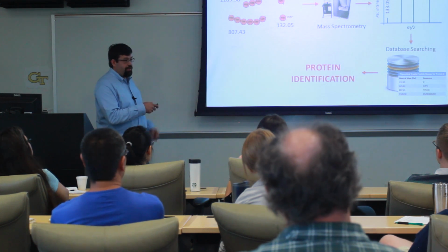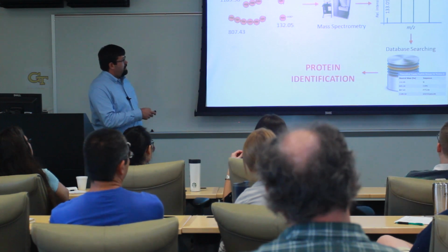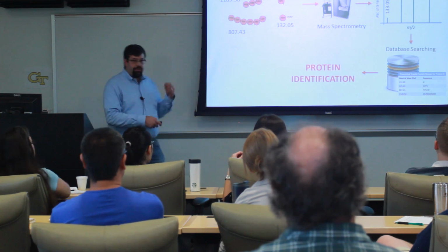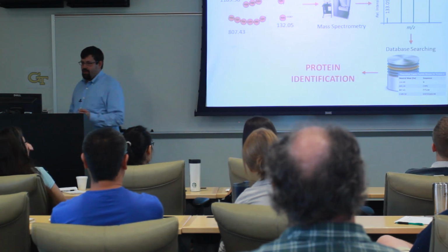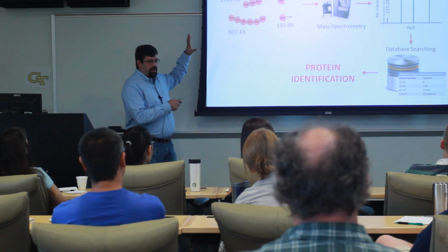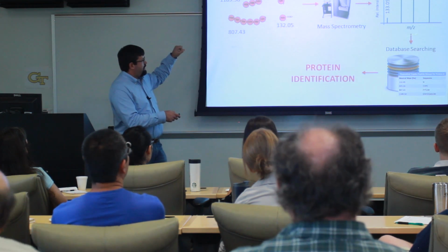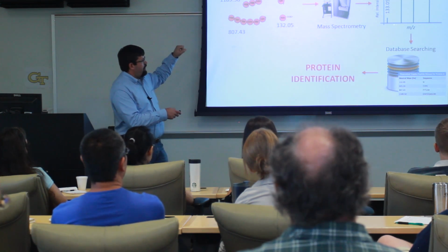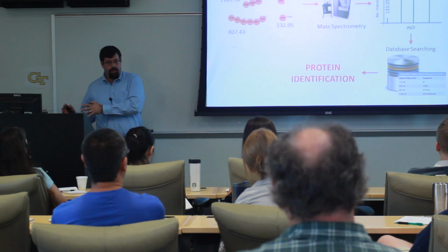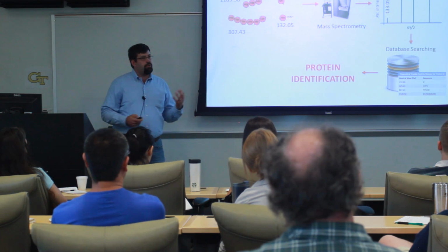We use mass spectrometry to accurately measure the mass of those peptide fragments, producing a mass spectrum. Okay, so this would be just an MS spectrum, not a tandem mass spectrum. This is just measuring whatever ionized peptides are in a sample. You would see a mass spectrum with m/z on the X, relative intensity on the Y. This could be done primarily using either MALDI or electrospray for proteins. And once we have that, that's essentially the fingerprint for the protein, right?